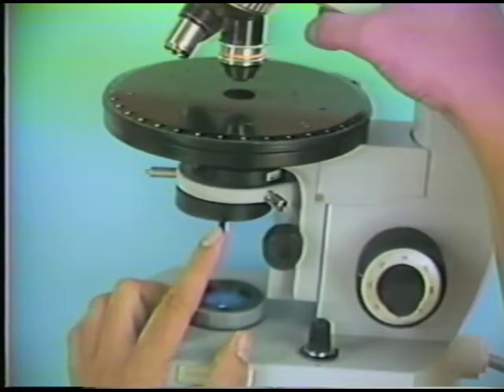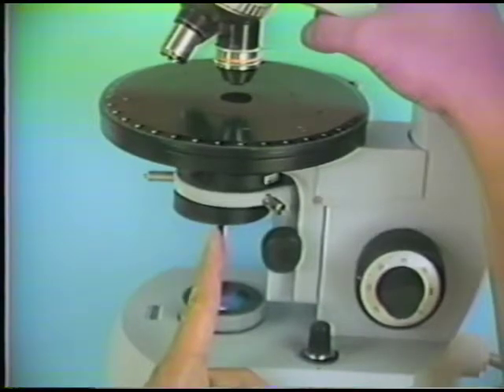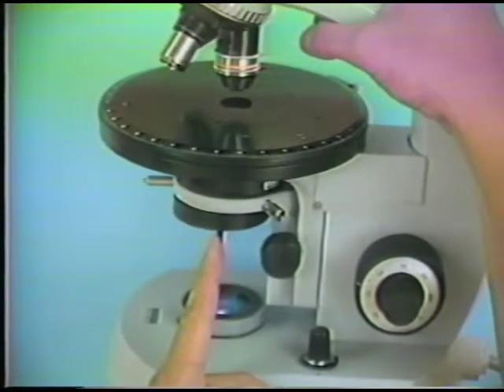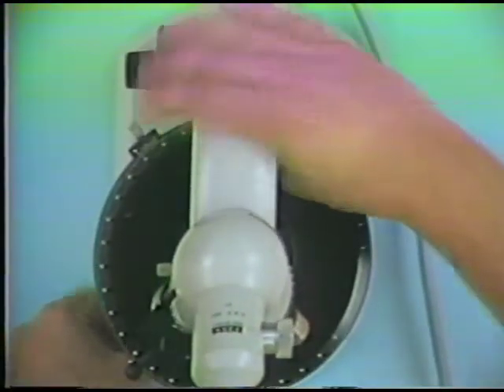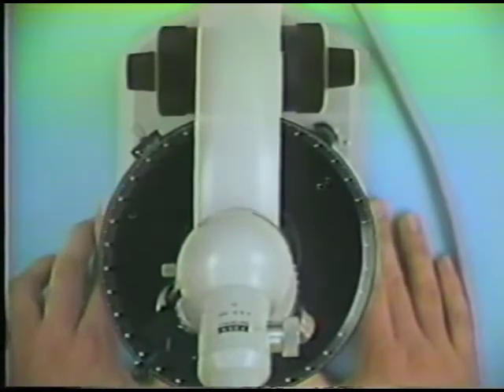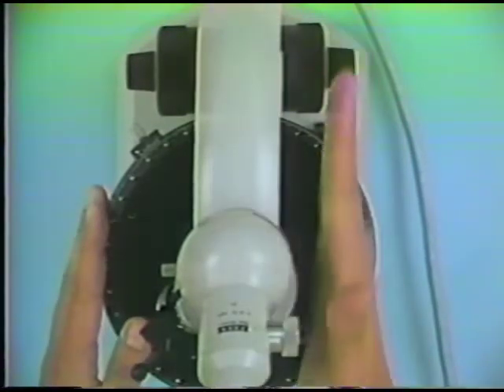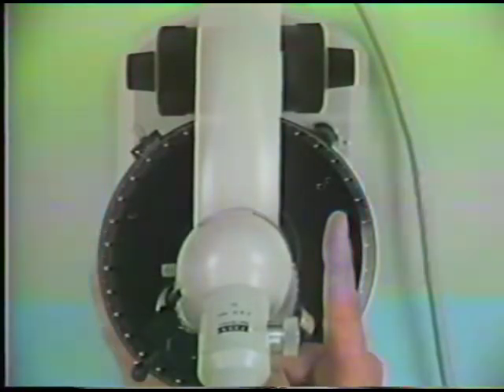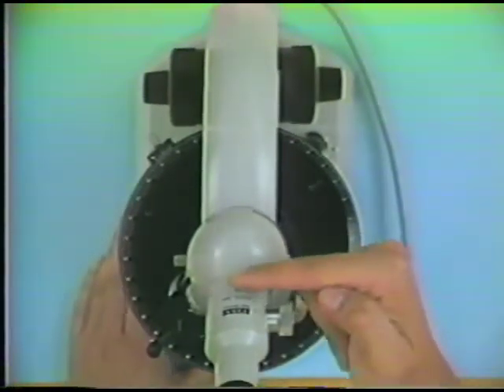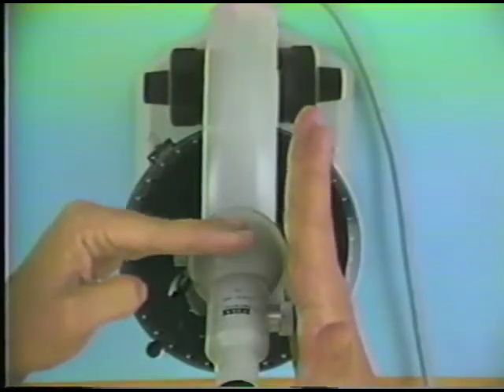Now this polarizer has a specific orientation, and I should be clear about this, but the orientation of polarizers uses a common kind of notation. So in order to do this, let me just place the microscope in a reference position like this. And this is the way you would normally look at it. And so if we look at this microscope in terms of the microscope stage, then this direction, the way in which my hand is pointing, is arbitrarily called north. It may or may not be north where you're sitting. And the direction across like this is an east-west orientation. This is a north-south orientation.